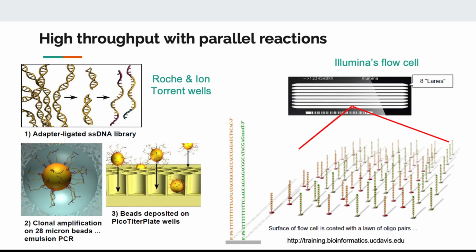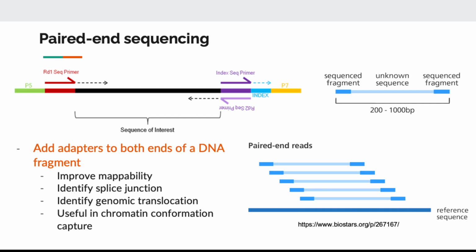not just one. And one benefit that we get from next generation DNA sequencing is that now we are able to sequence both ends of a DNA fragment. Right? With Sanger, it's only one end. You start from 5' to 3'. But sometimes you just need information from a short sequence from the 5' and a short sequence from the 3'. And you can use that information to map the location of your read without having to know the full sequence.